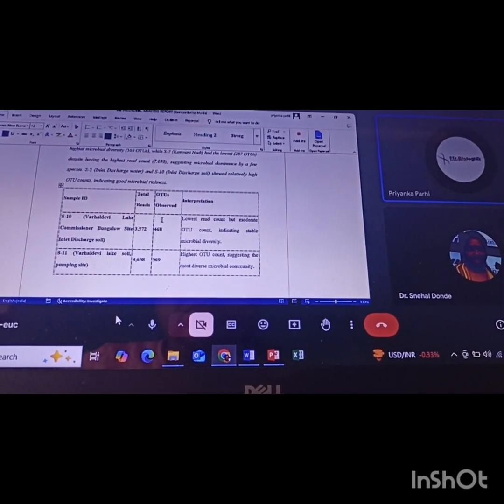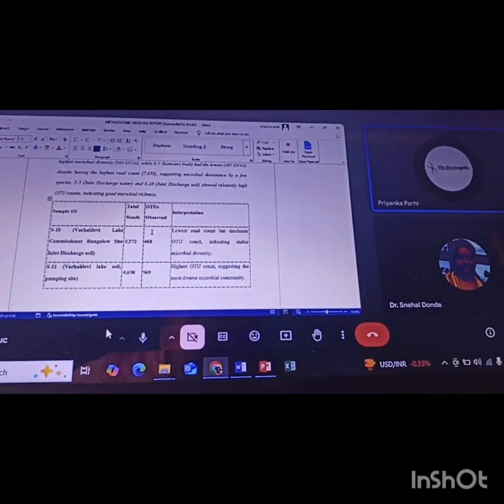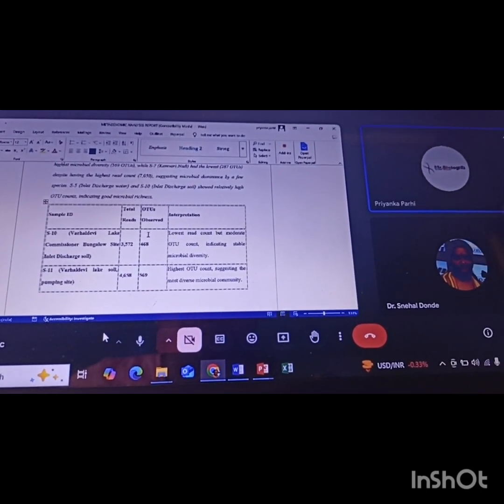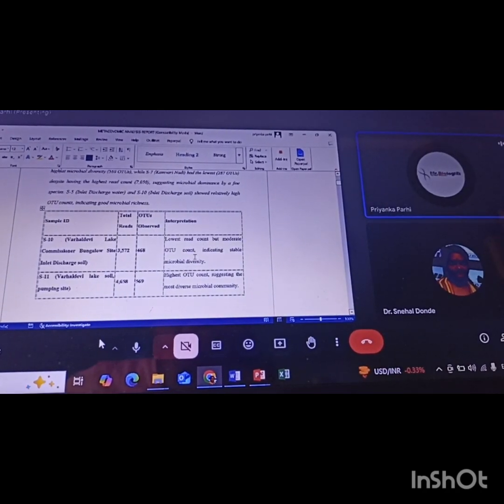Now we can use those units to analyze the microbiome further and see which sequence matches with which particular microbe according to genus and so on. Do you have some standard with which you match? The software we use comes with preset standards. That is used, and if you can see, I have added interpretations also.